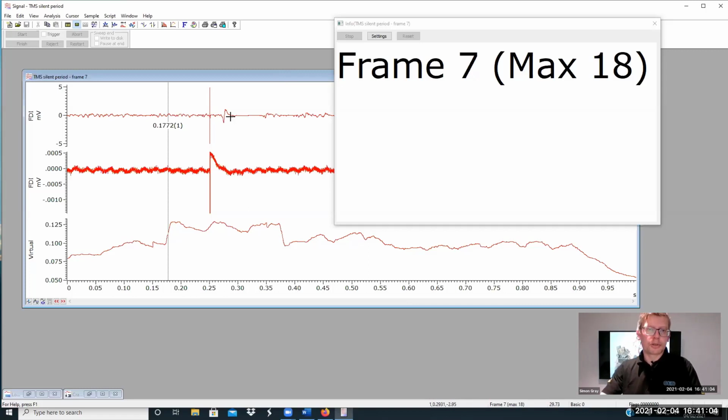There are functions such as Control-Alt to take measurements. There's a peak-to-peak. If I drag right, you're getting a time as well as amplitude. If I drag right with no Y change, it's only direction. And same if we go vertically here, okay, for amplitude.